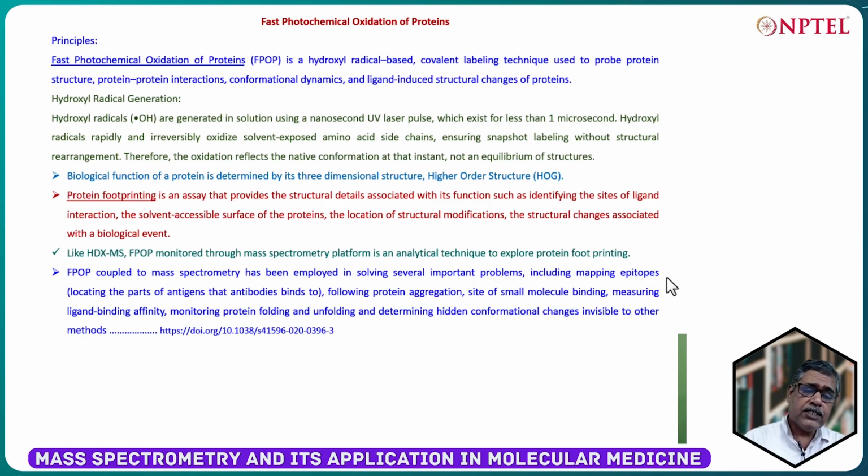Now, we have studied HDX, isotope exchange based mass spectrometry, that is also used to understand the molecular conformational changes associated with a biological event. And like HDX, FPOP, also monitored through mass spectrometry platform, is an analytical technique to explore protein footprinting. And as I said just now, protein footprinting includes any structural change associated with a biological event.